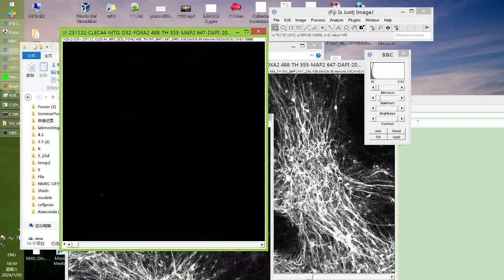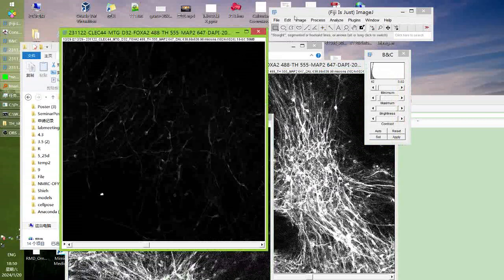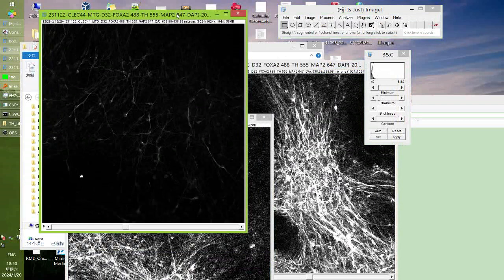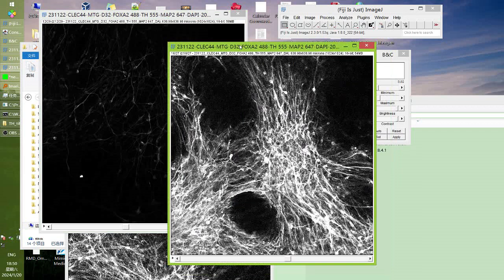Okay, first we need to combine them together. For the stack, the difference is that it is 3-dimensional, it's not 2-dimensional. So there are more considerations when we want to merge them together into a single huge file for the training.